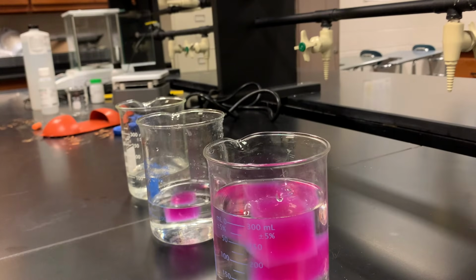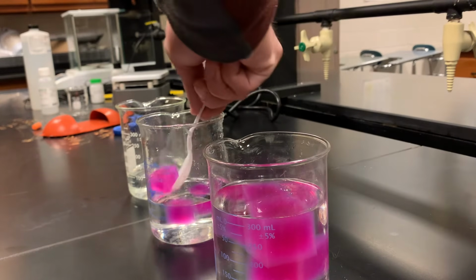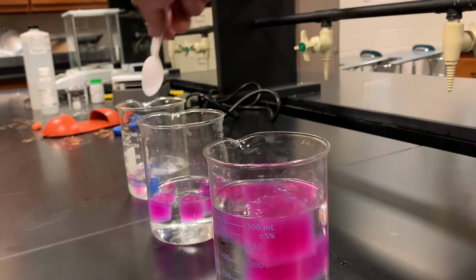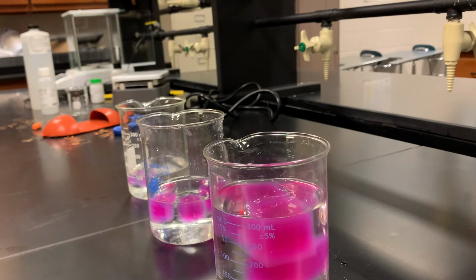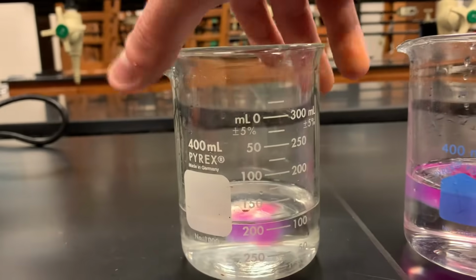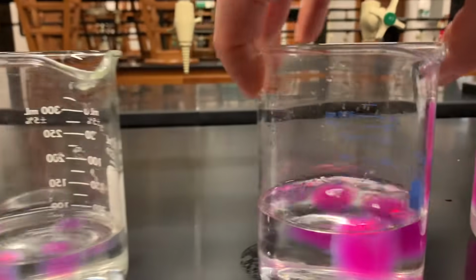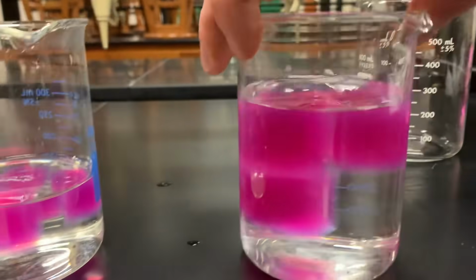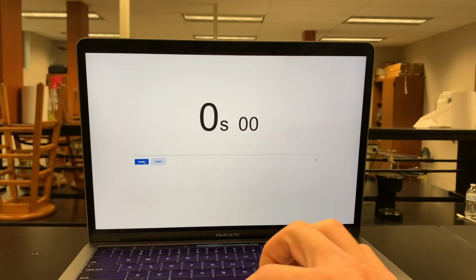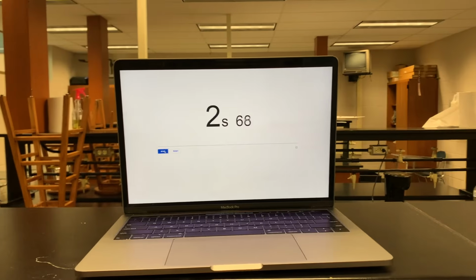So in one beaker, I put all of my 3 centimeter cubes. In my second beaker, I put my 2s in. And in the last one, I'm going to put my 1 centimeter cube in. All right. So each one, you guys can see them there. We have our 1s, our 2s, and our big 3s here. So I'm going to start a timer here. We're going to give it about maybe 5 to 7 minutes.